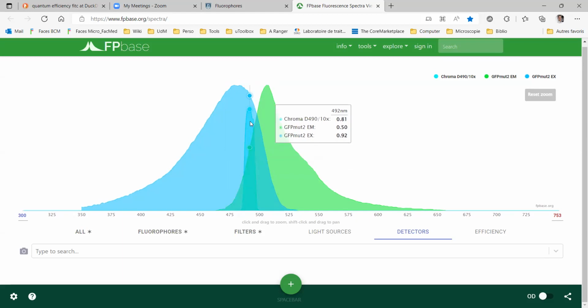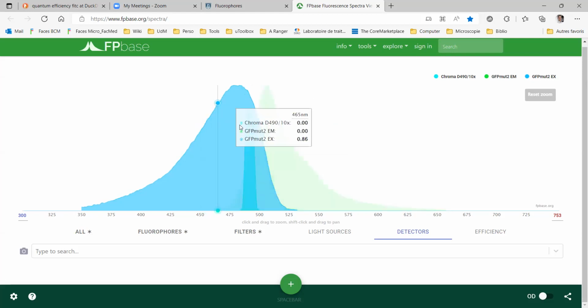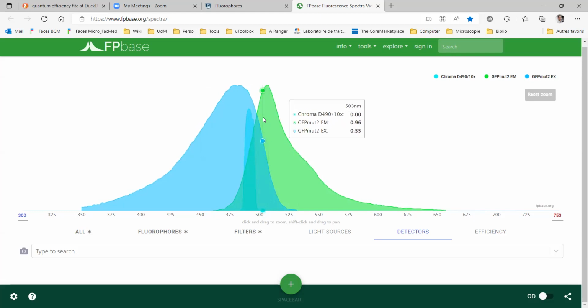Because you don't usually know all the microscopes, the first approach is to come to me or to the person who is responsible for the microscope and ask, have you ever used this? Is it working well? And they will let you know. Another thing is, when you start using a microscope and you know that GFP works very well on this one, if one day you come and your sample doesn't work, you know it's not because of the filters, because you have used it before. So empirically, you can determine it. The best thing is to come to us if you have a doubt and ask, is this going to work on this specific microscope? And based on the camera and the light source and everything, I will tell you yes or no, it's going to work well or not.